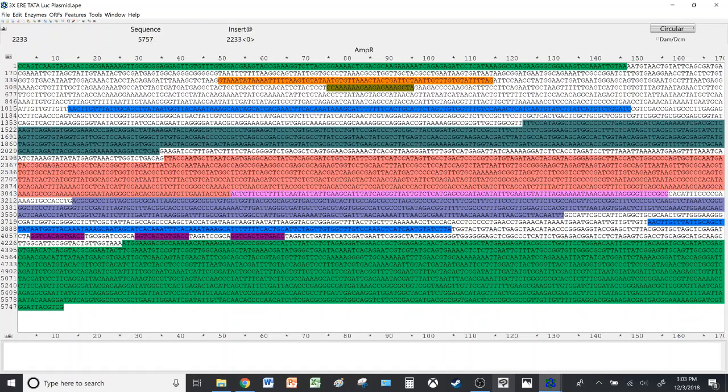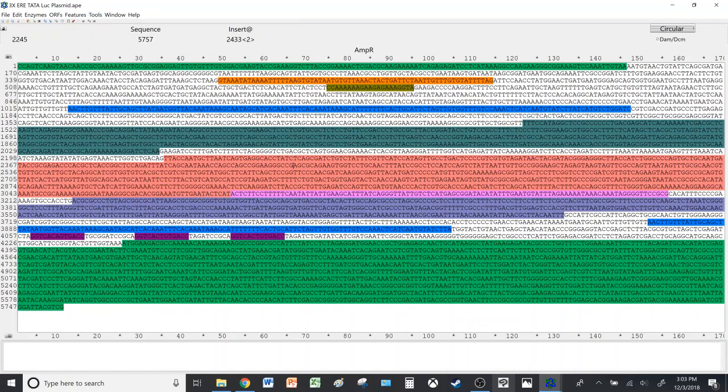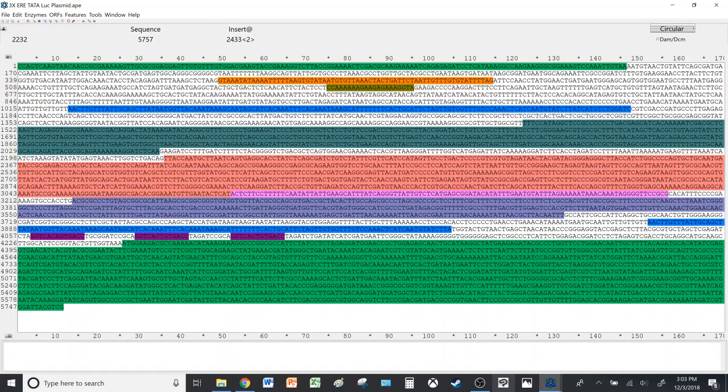And then finally we have the sequence alignment, and I had to do that once in my research. After I modified my plasmid by cutting at certain points with restriction enzymes and then adding sequences, I wanted to make sure that the seams ligated properly. So I sent my plasmid to Toronto for sequencing.